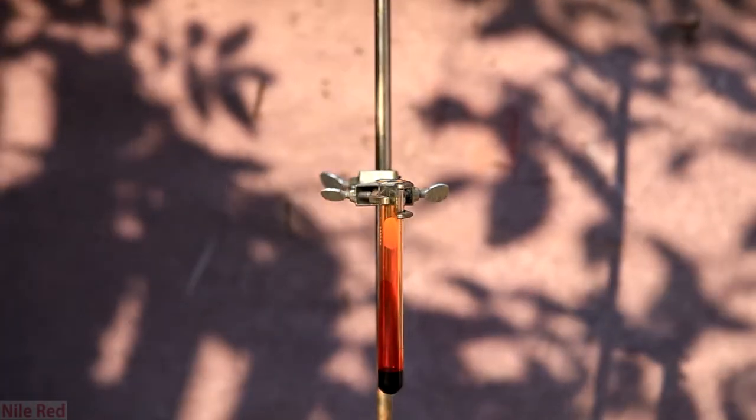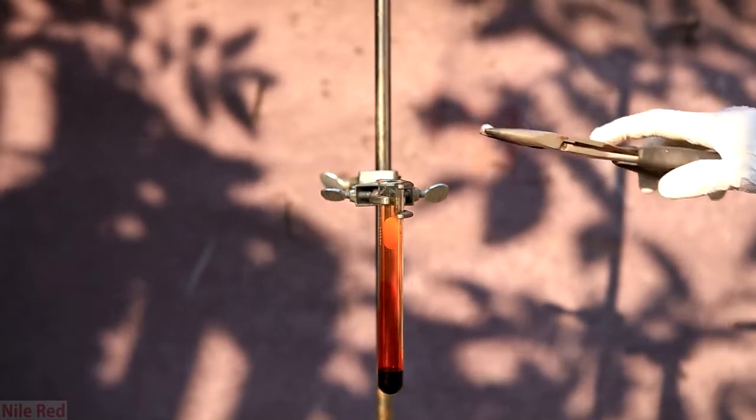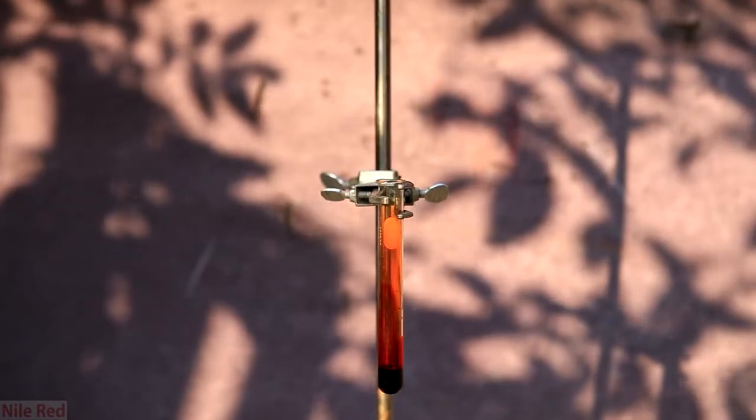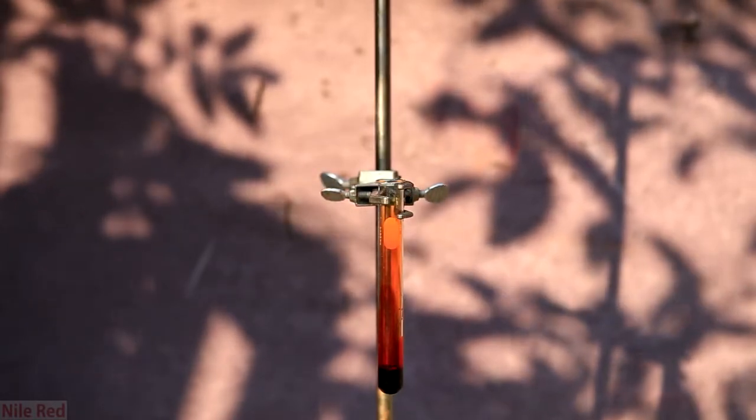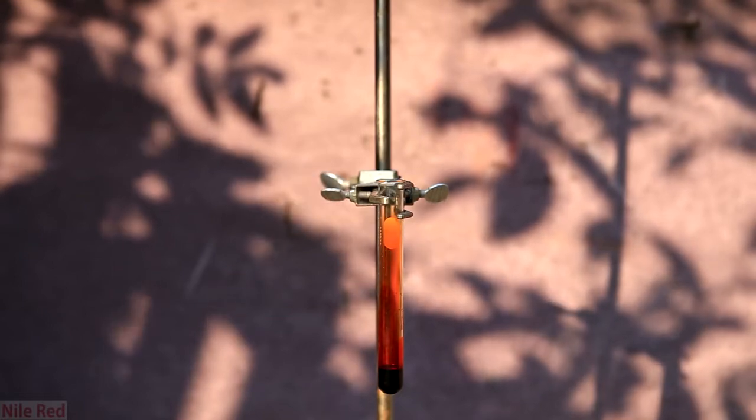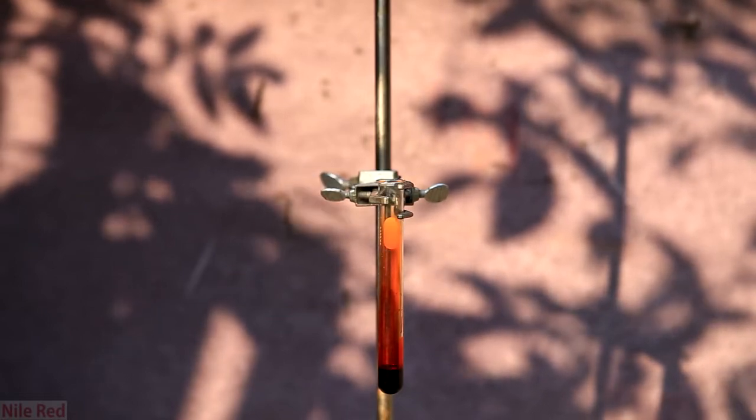For the second run, I opted to use the aluminum ball that I got in the previous one. And in this run, due to the decreased surface area, it took a much longer time to react. And once it did start reacting, it wasn't nearly as spectacular as the first one.